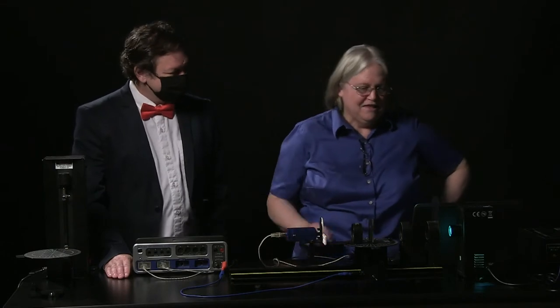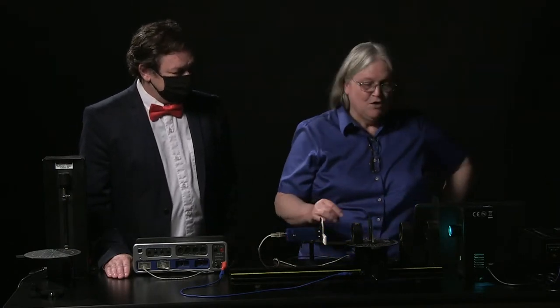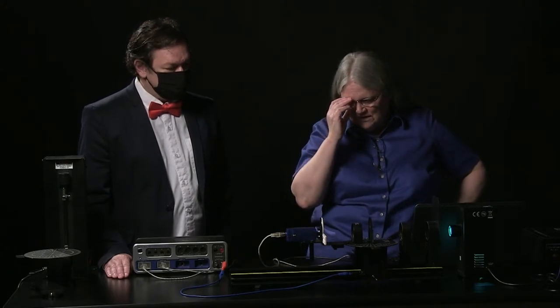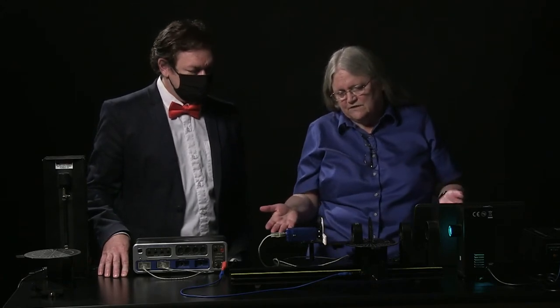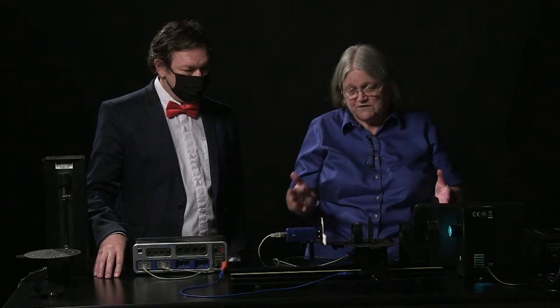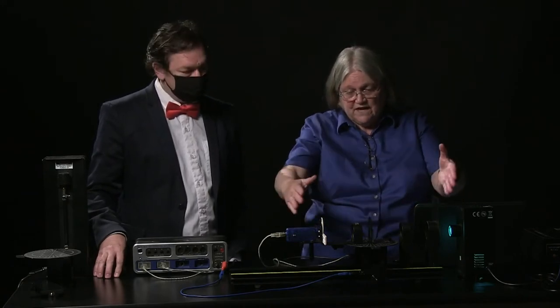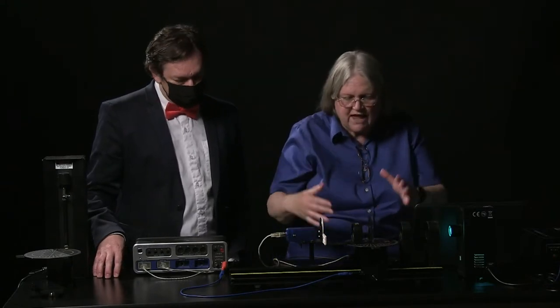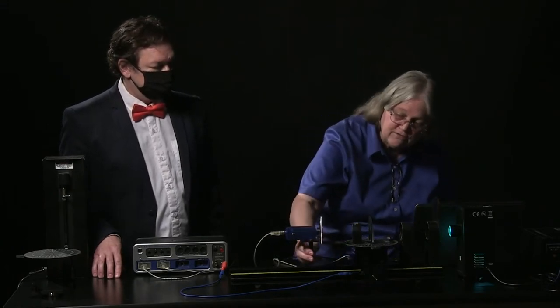Hello, I'm Ann Hanks from PASCO Scientific, and my name is Brett Sackett. I am Ann's partner in physics — partner in crime. We're going to be talking about the educational spectrophotometer. This is a device that we invented a long time ago that takes the guts of a regular optical spectrometer and opens it up so that students can see the paths of the light, where the light is going, and how it ends up showing you the spectrum.